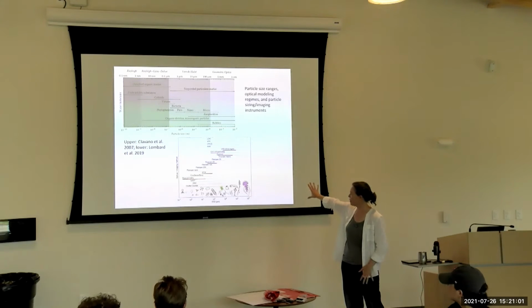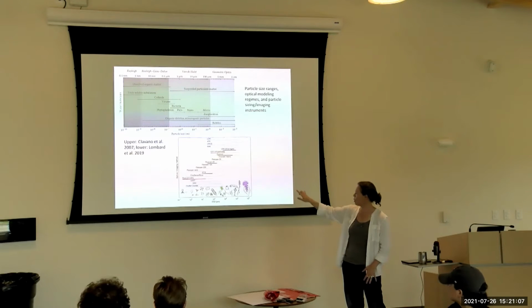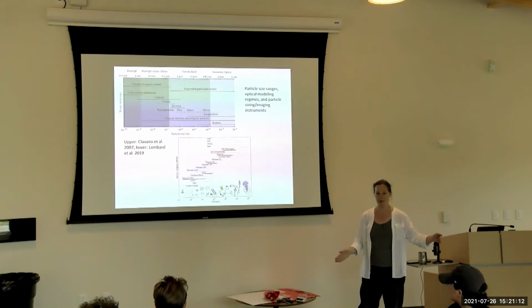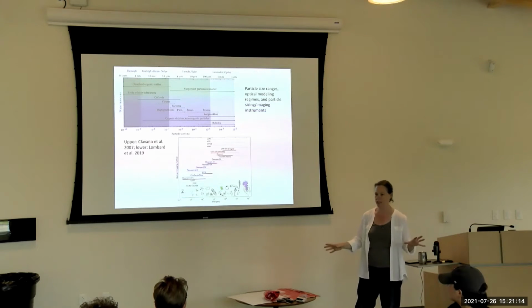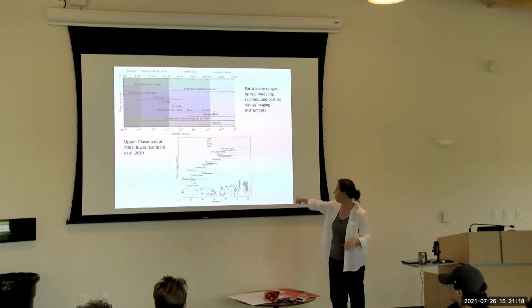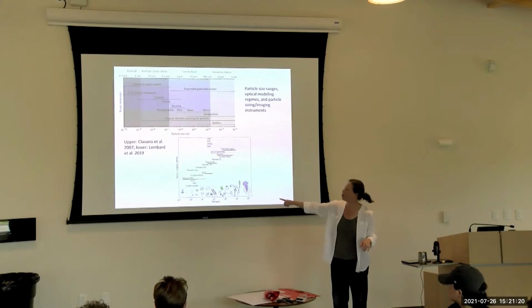Another nice figure came out of a review paper, Vivian Lombard et al. a couple of years ago, that basically imposes the size detection limits of different imaging and a few other particle detection instruments in modern use on the equivalent spherical diameter of particles.